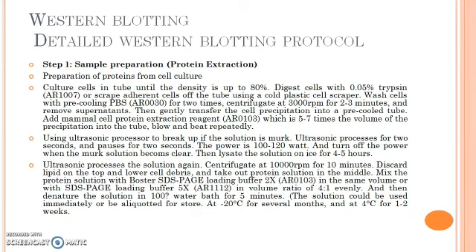Mix the protein solution with Booster SDS-PAGE loading buffer 2 times in the same volume, or with SDS-PAGE loading buffer 5 times in a volume ratio of 4:1 evenly, and then denature the solution in a 100-degree water bath for 5 minutes. The solution can be used immediately or aliquoted for storage at minus 20 degrees Celsius for several months, and at 4 degrees Celsius for 1 to 2 weeks.